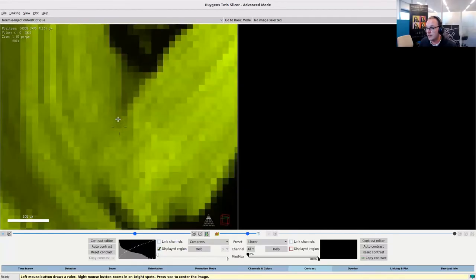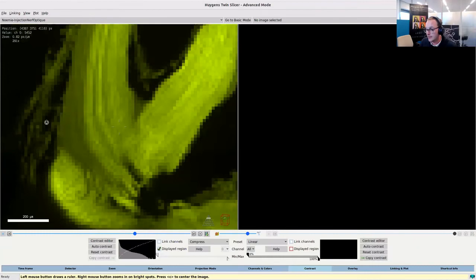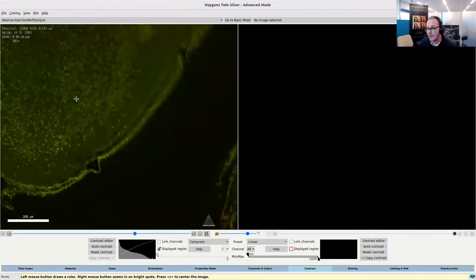Just now I was at an intermediate resolution, and I'm going to zoom in further to look at the highest resolution that we have. Here we go. I can also look in other places, for example, and we see a different morphology between these two regions, and that works.